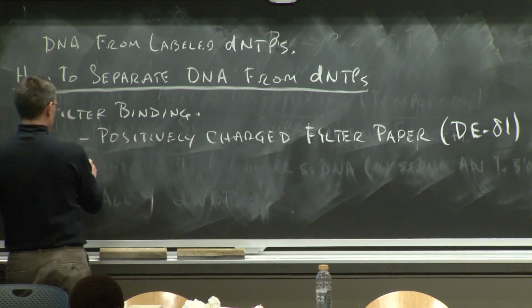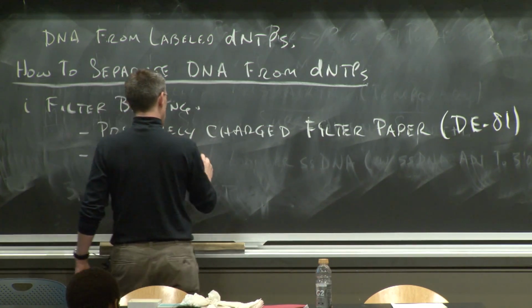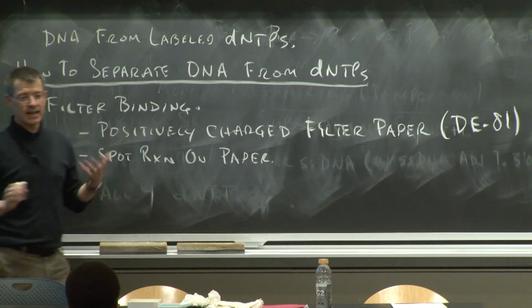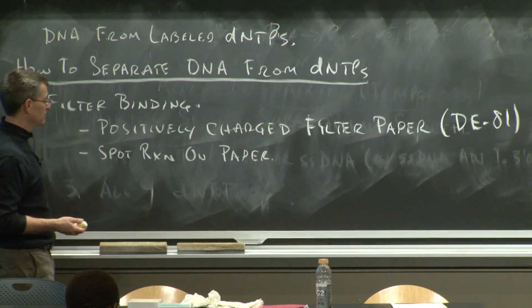You spot the reaction on the paper. And one of the nice things about this is that that actually kills the reaction very quickly because that will rapidly dry, and a dry reaction can't work. You need water for the reaction to go.